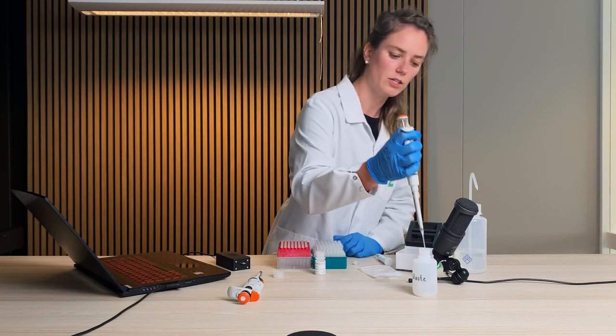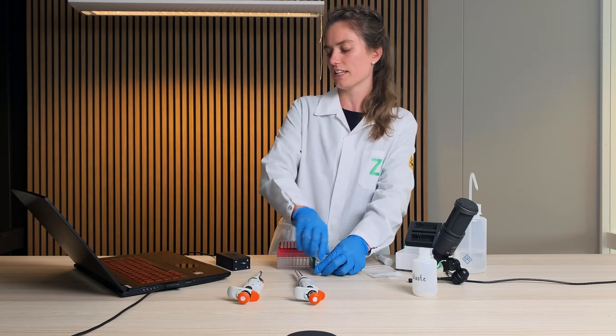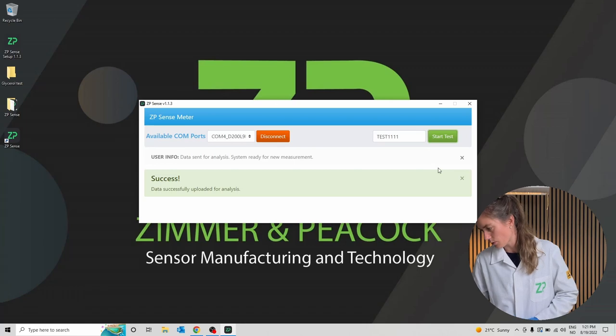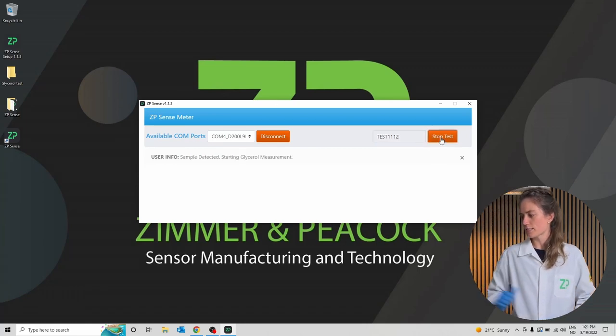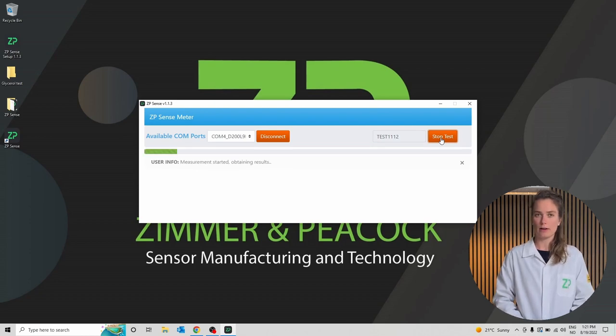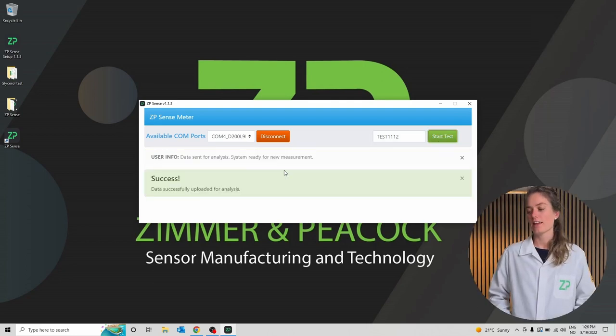I'll dispose of the pipette tip. I will call this next test test 1112 and click start test. We have to wait two minutes for the measurement to finish, so we will speed up the recording. Now the second test is completed and we save the data again in the same folder.